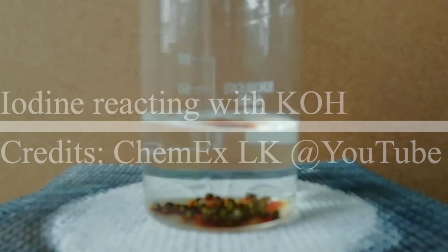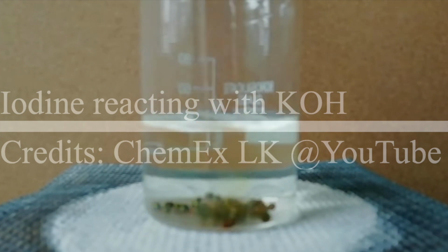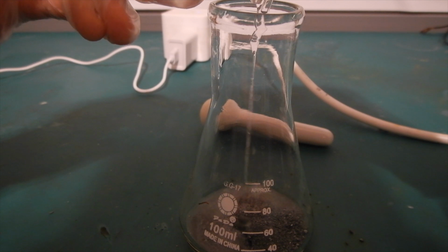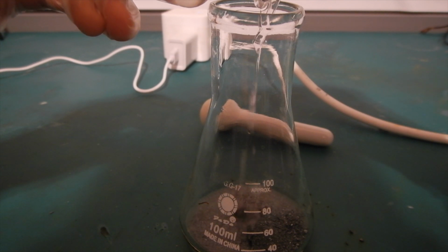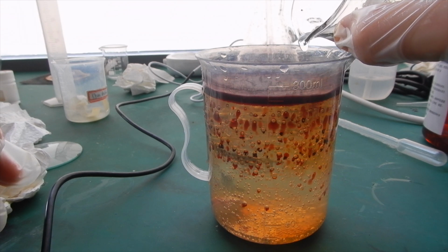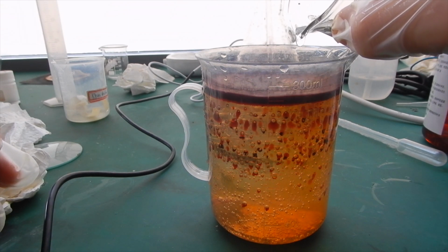However, I wanted to try another method which involves hydrogen peroxide. Mixing a solution of acidified hydrogen peroxide with iodine would give clean iodic acid at high yields, and adding potassium carbonate to it would produce potassium iodate.